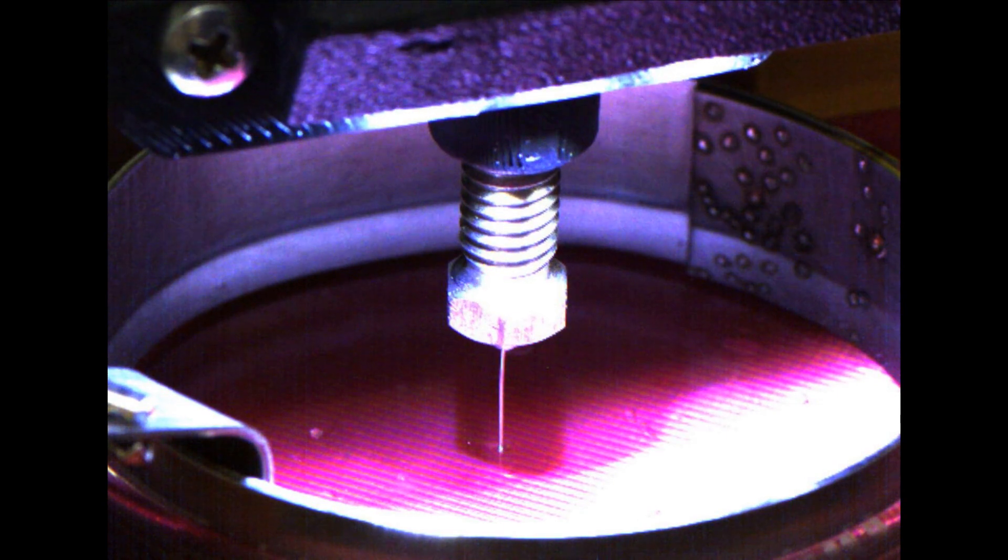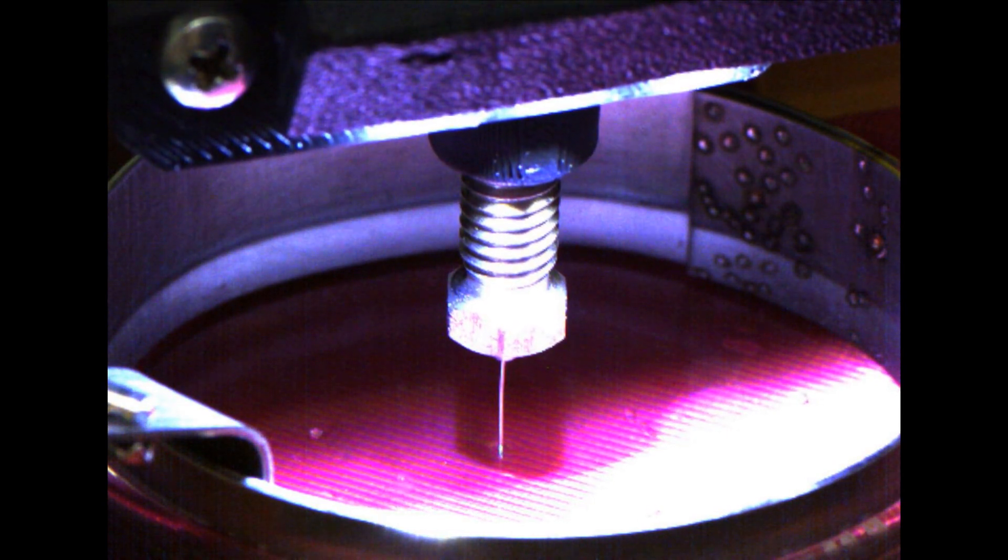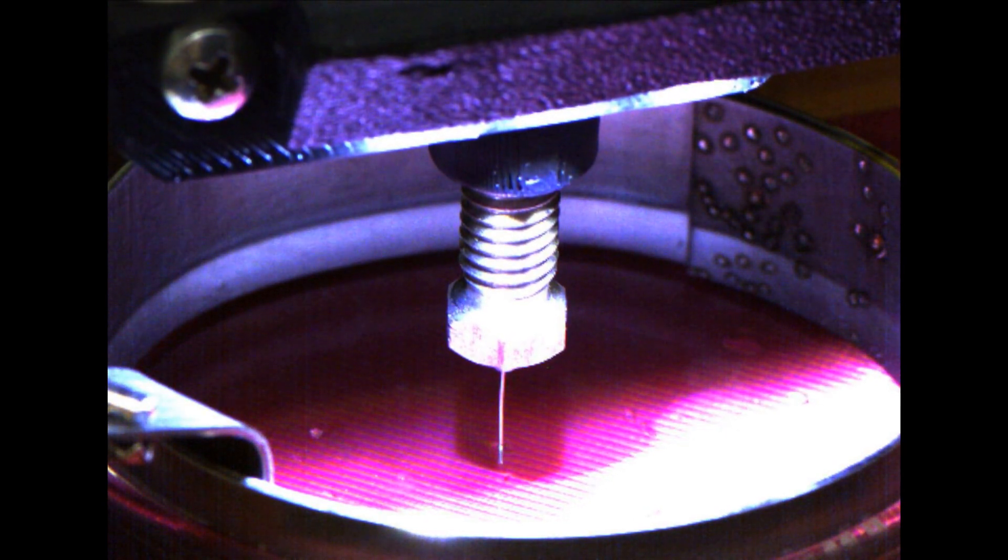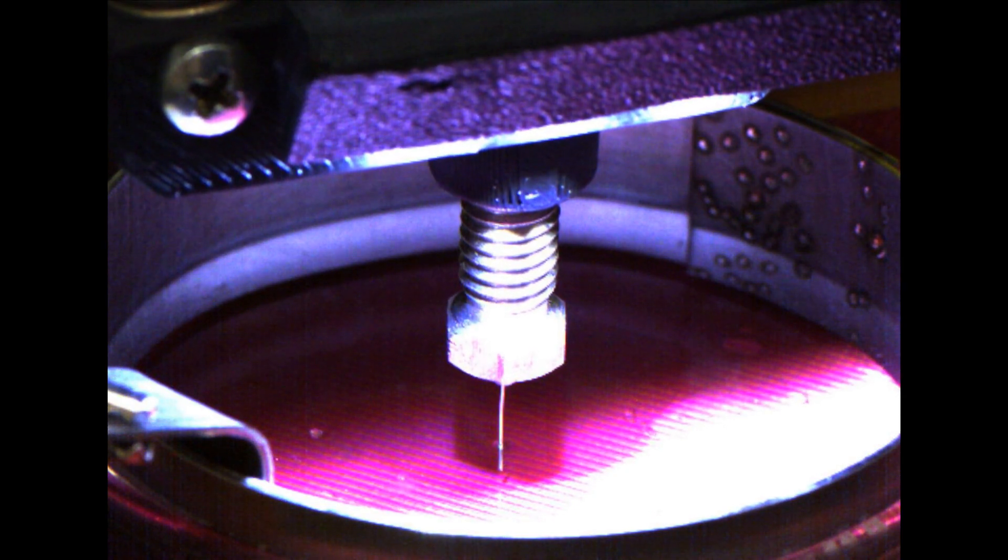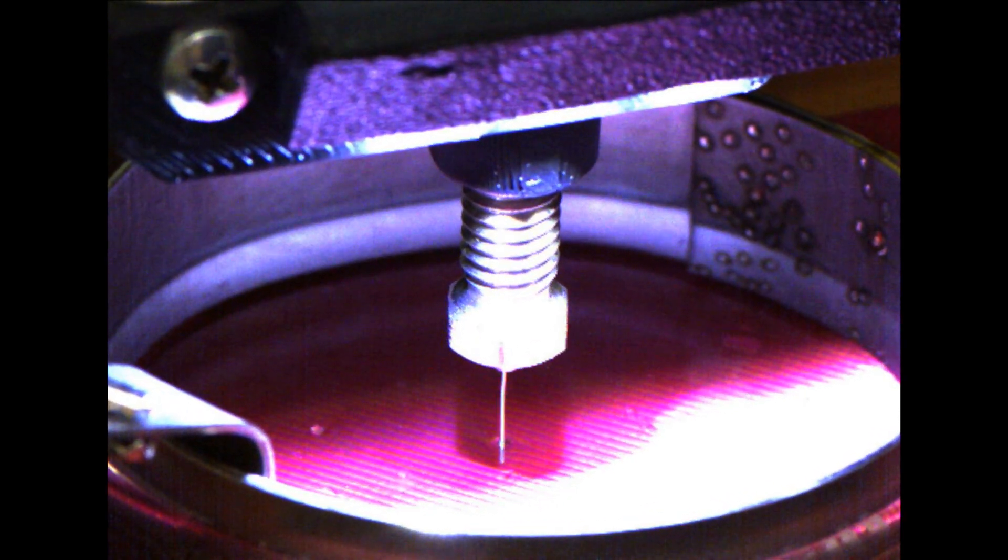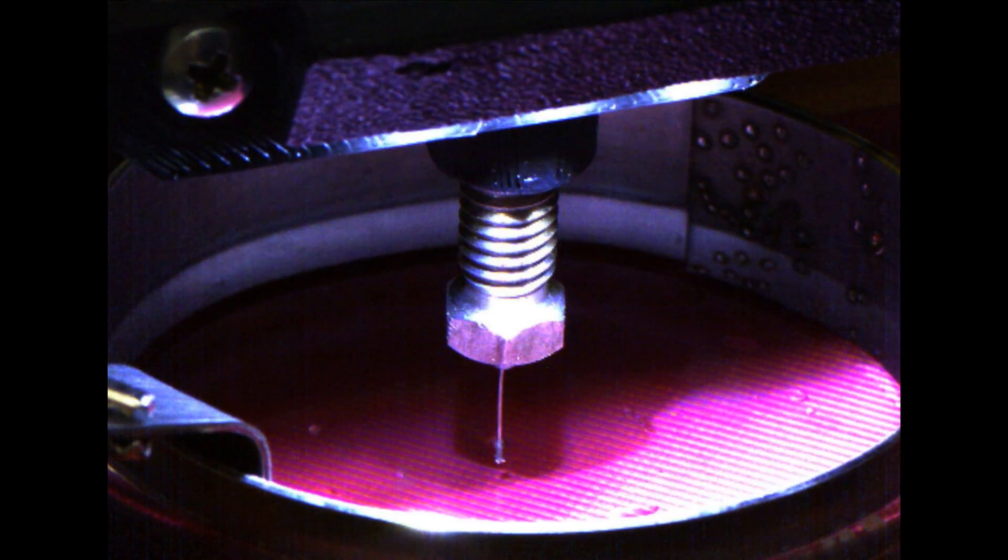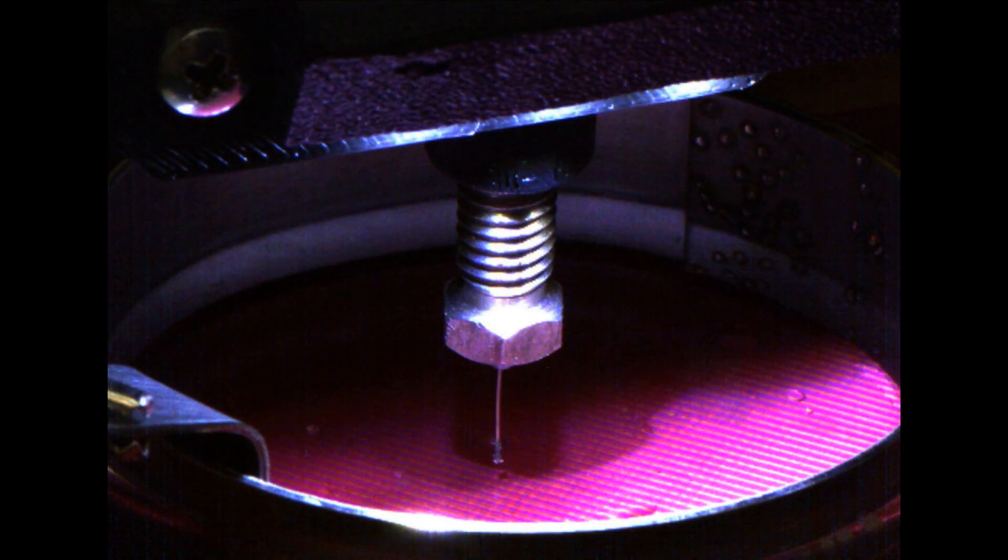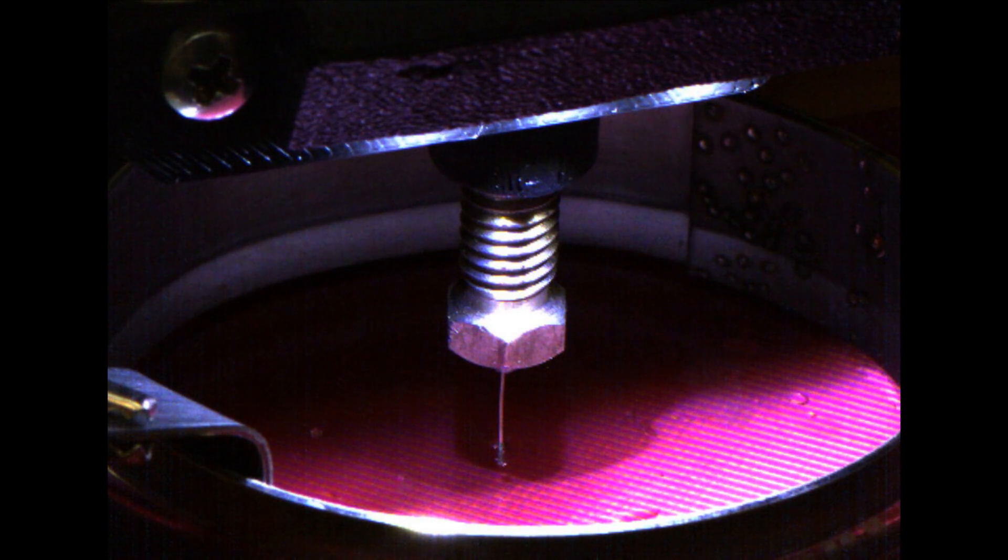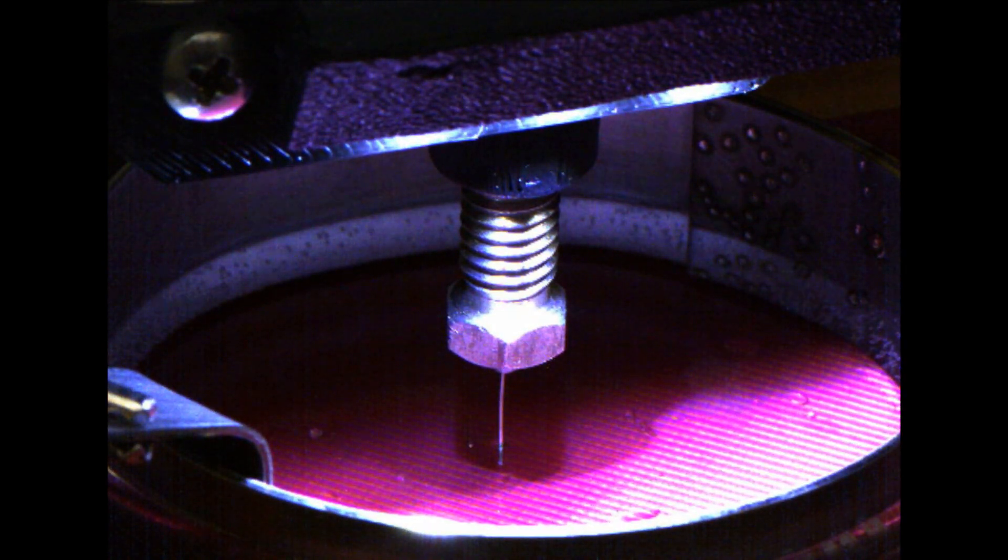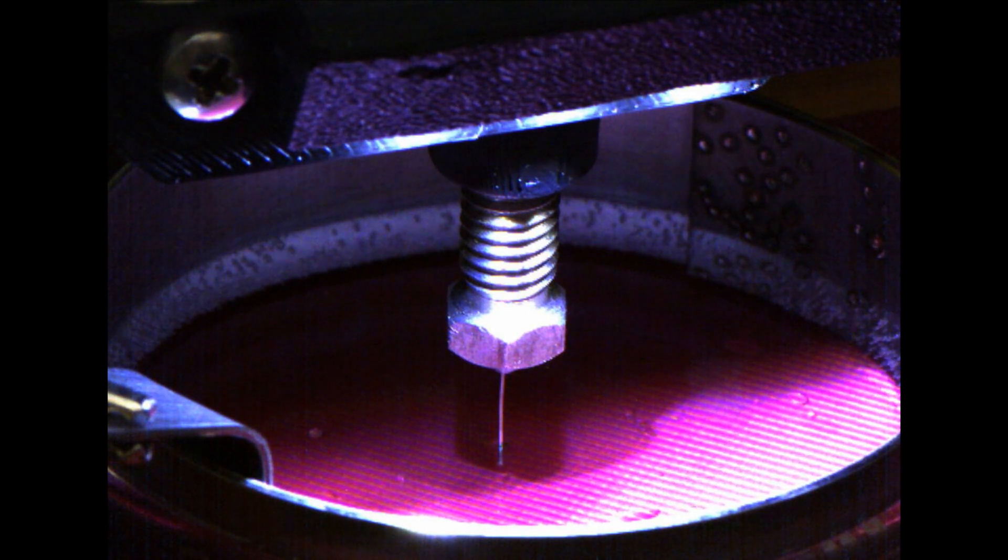This first video is an up close view of a standard etch. You can see hydrogen bubbles forming at the stainless steel electrode ring and debris staying clear of the tungsten. Eventually, etching at the meniscus becomes significant enough to create an impingement, breaking the bottom of the tungsten from the top. Etching is stopped immediately after by measuring the increase in junction resistance between the etchant and the wire.